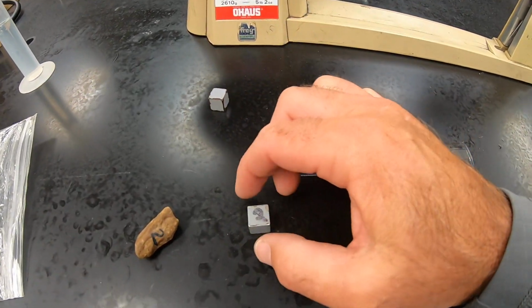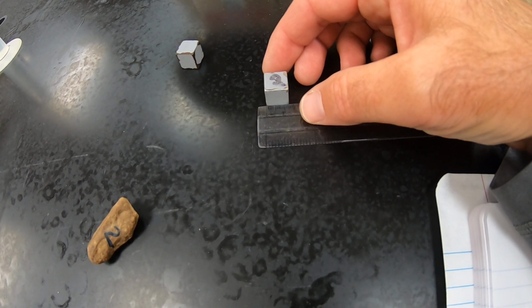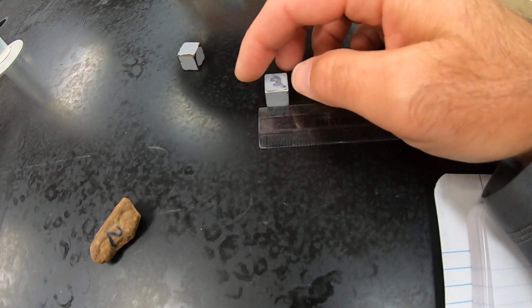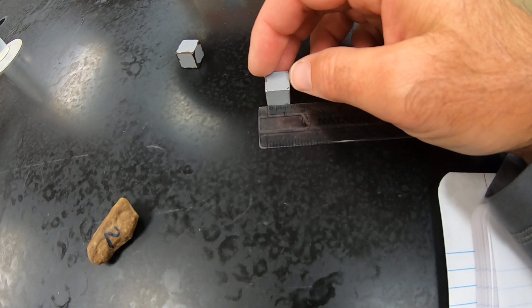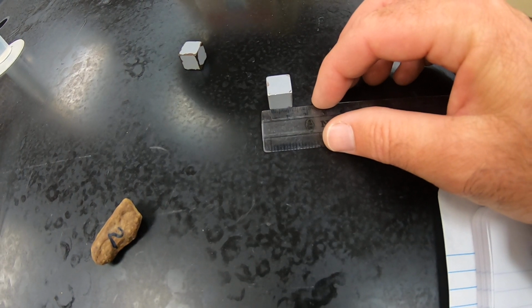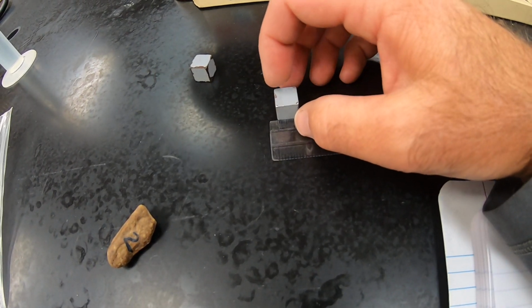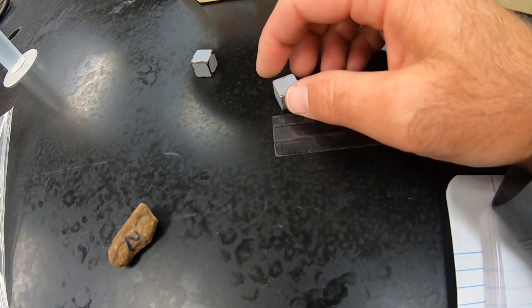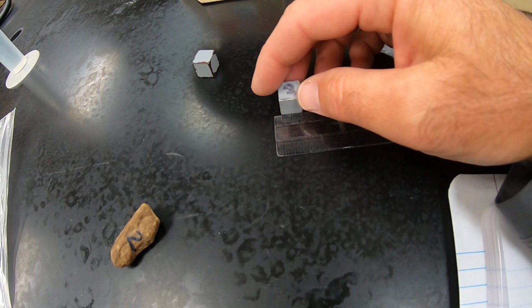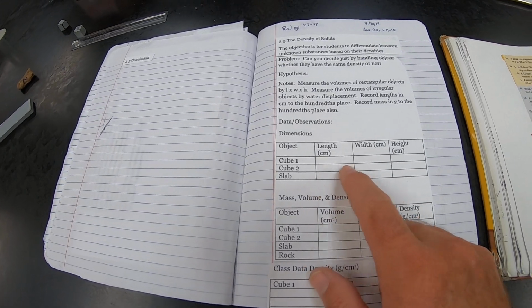Then we're going to look at the second cube. We'll do the same thing. It looks like it's almost exactly the same, 1.20. The height is 1.20. And then the width, we'll turn it this way, is 1.20. So it should be 1.20 on all sides. So for the cube, we'll say 1.20, 1.20, and 1.20.